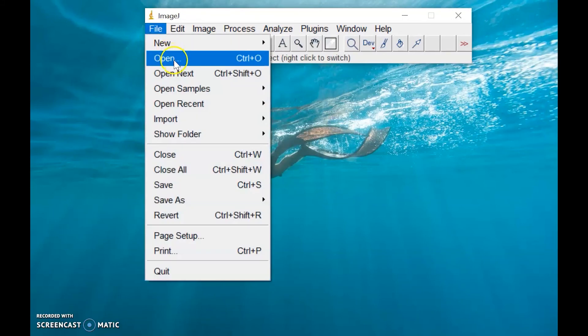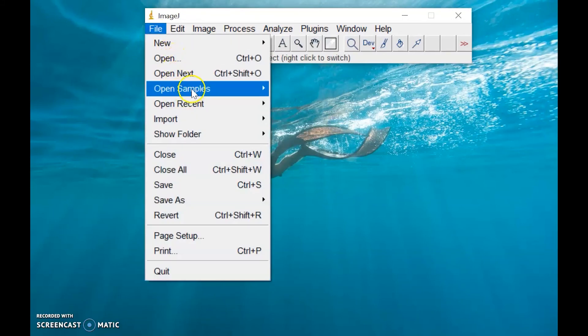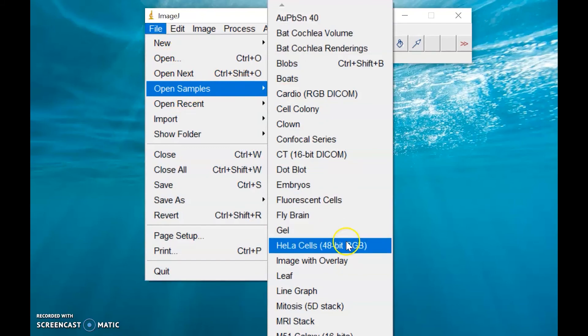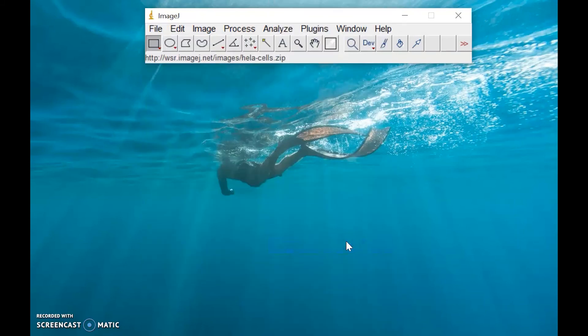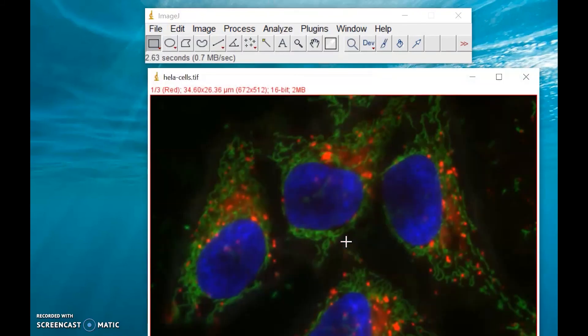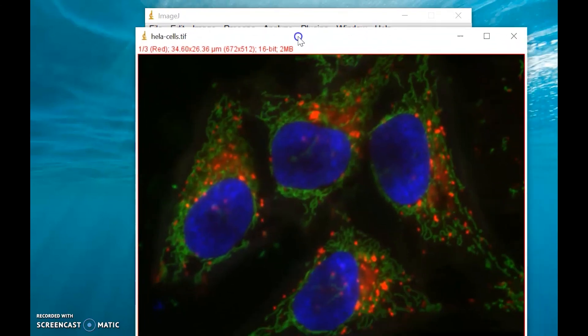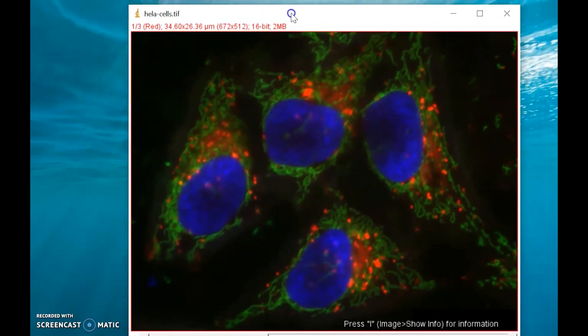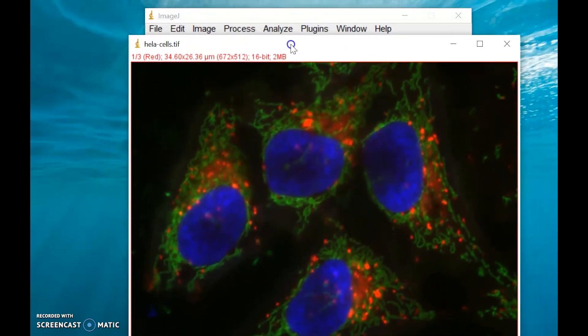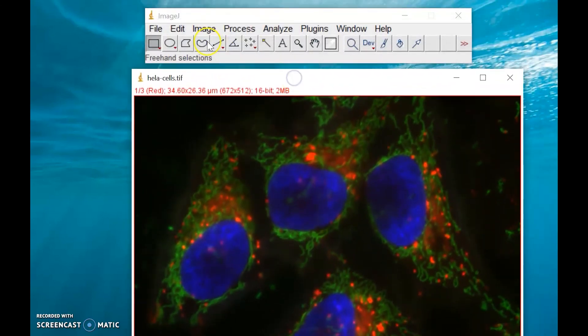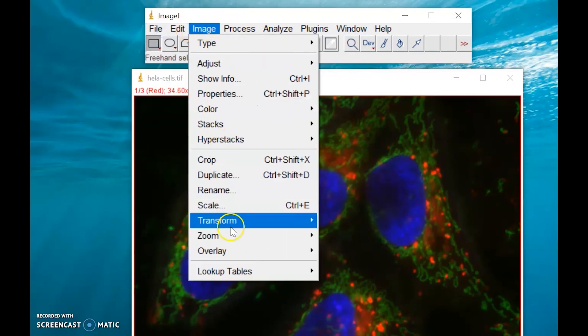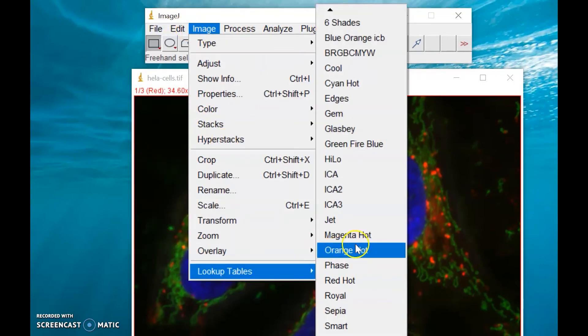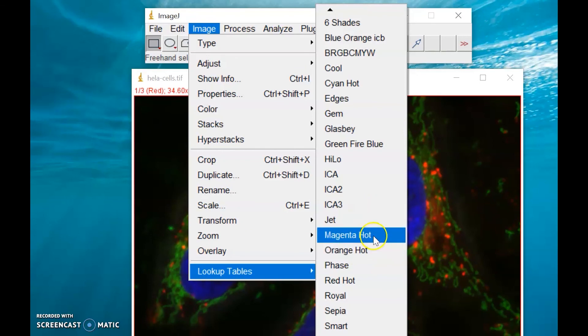Let's try to open a sample image file. Let's say HeLa cells, which is one example of RGB image, and we have this image of HeLa cells. You can apply a lookup table for this image.